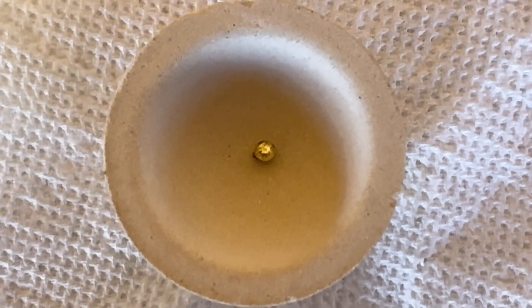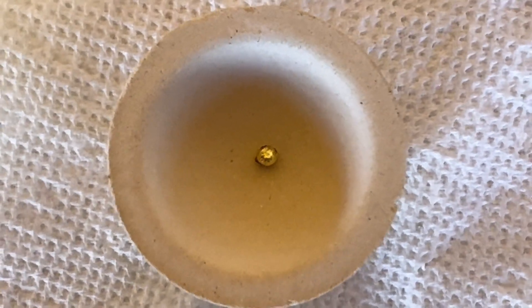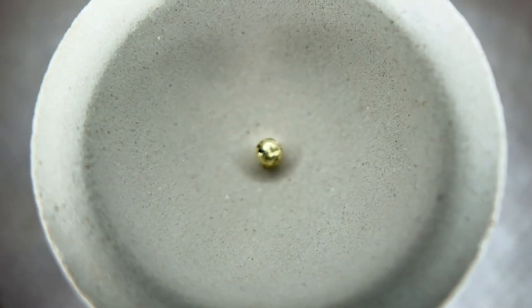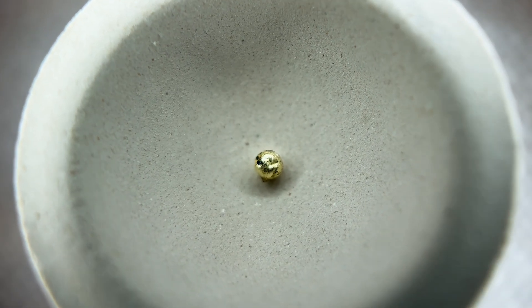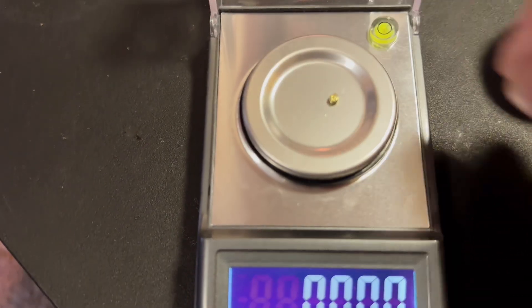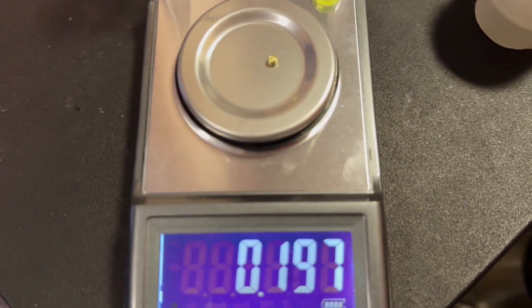Here is our gold bead — I did take a pair of tweezers and pull the gold bead out of the crucible dish and put it in this cupel. Our gold bead weighs 0.196 of a gram.